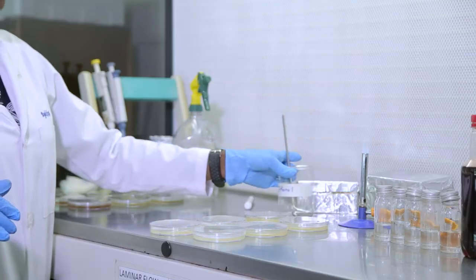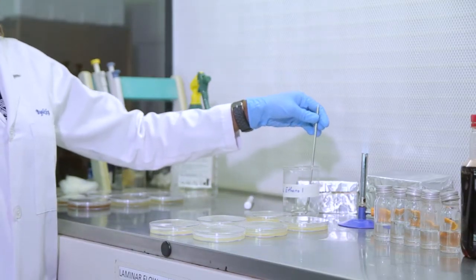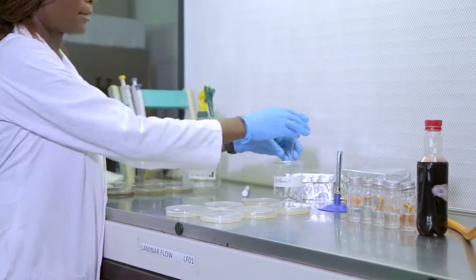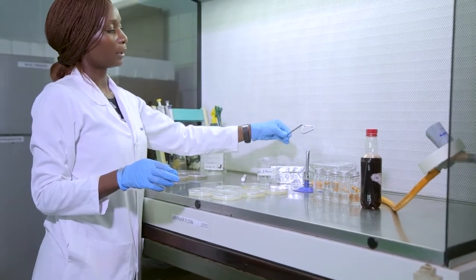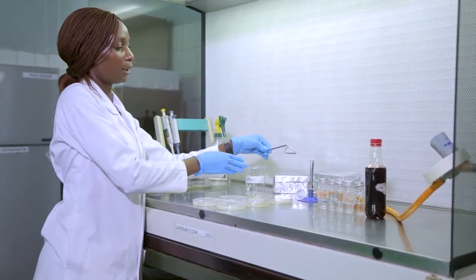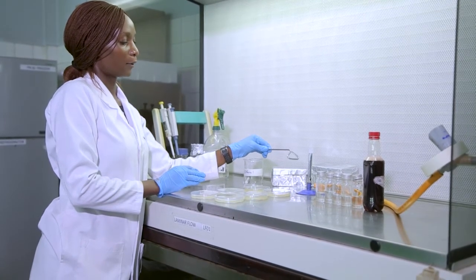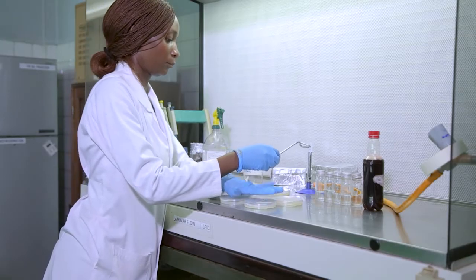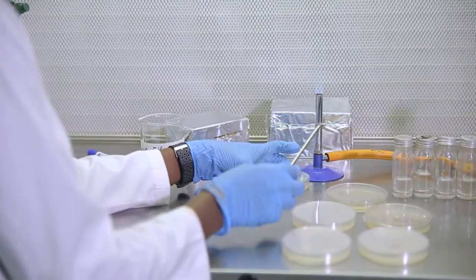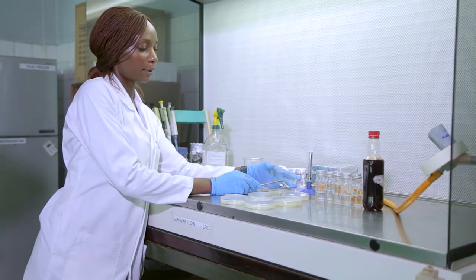So next we have to spread the inoculum evenly on the surface of the agar. So using my metallic rod or spreader, I insert it in absolute ethanol or concentrated ethanol and quickly pass it over the flame and allow it to burn. Okay, after it has finished burning, close to the flame, I'm not going to spread directly. I'm going to first cool it on the agar surface.